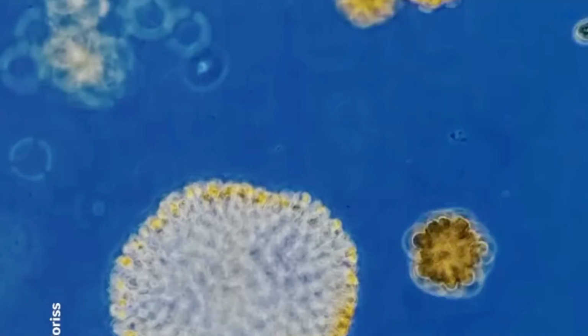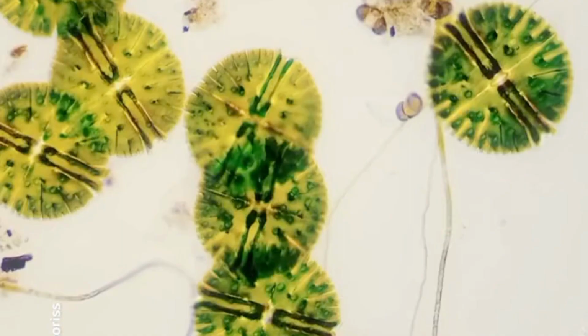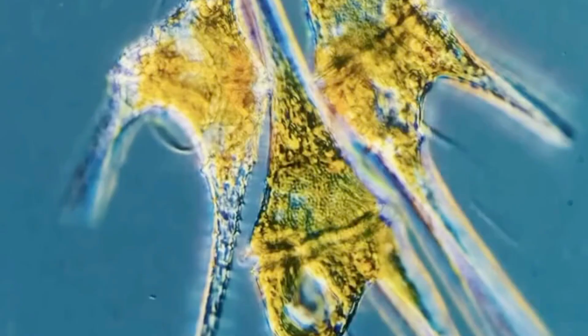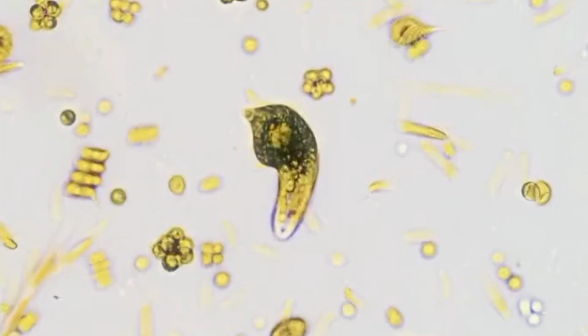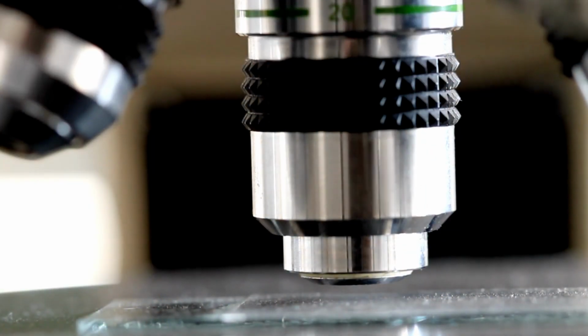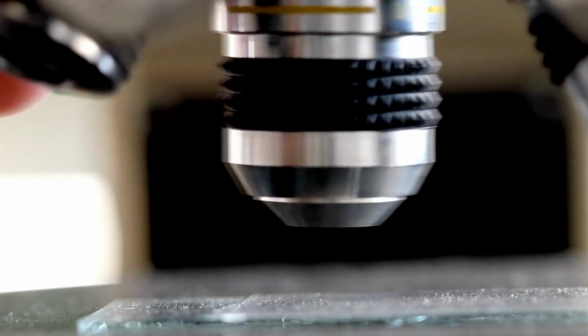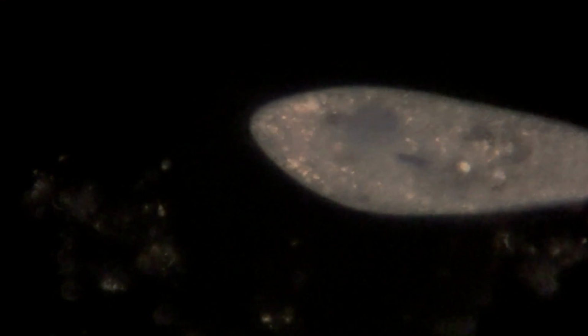Long ago, people believed that the world we see with our eyes was all there is. To them, a drop of water was nothing more than a clear liquid, and a patch of mold was just a stain on bread. But when the microscope was invented, everything changed. Suddenly, hidden worlds were revealed.